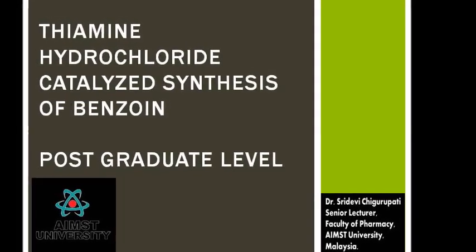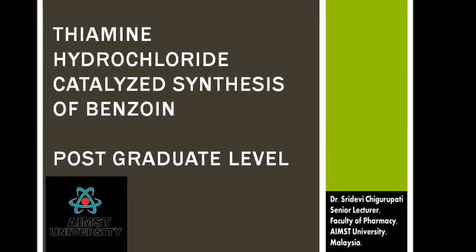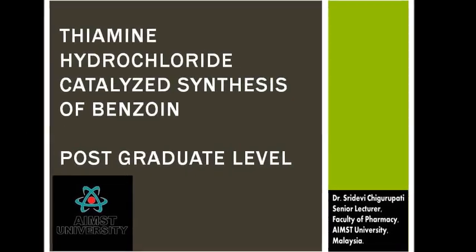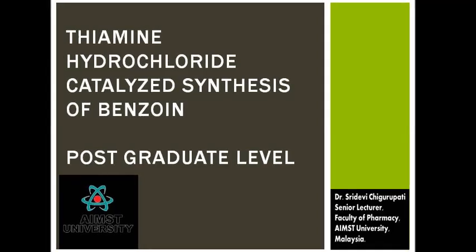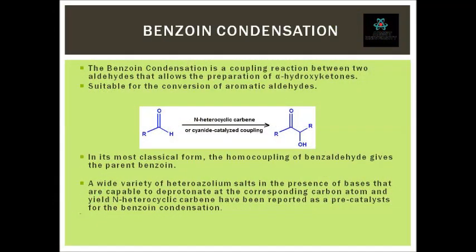Today we begin our first topic, thiamine hydrochloride catalyzed synthesis of benzoin. This experiment can be allotted for the postgraduate level students. Let us see what is benzoin condensation. Benzoin condensation is a coupling reaction between two aldehydes that allows the preparation of alpha hydroxy ketones.